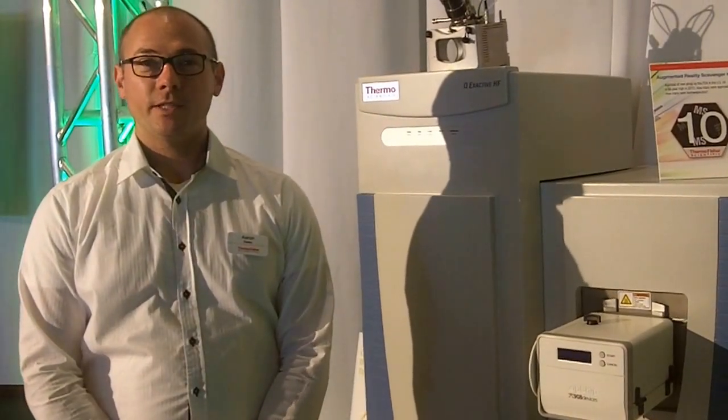Hello, my name is Aaron Bailey. I work in life science, mass spectrometry, biopharma marketing at Thermo Fisher Scientific.